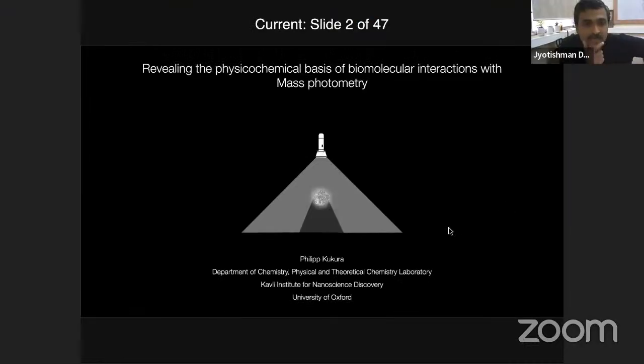Sure. Could one do intensity-based correlation in ISCAT using a prominent scattering probe, like one does in FCS using a fluorescent counterpart? I don't see why not.